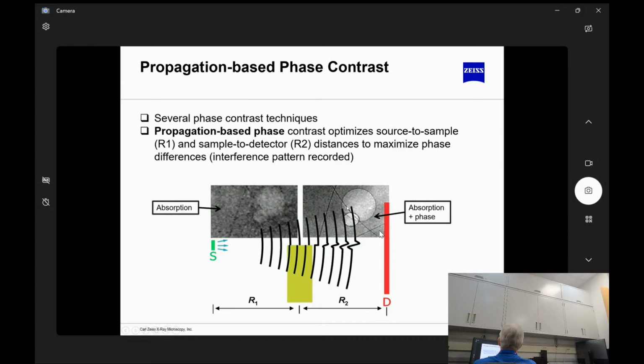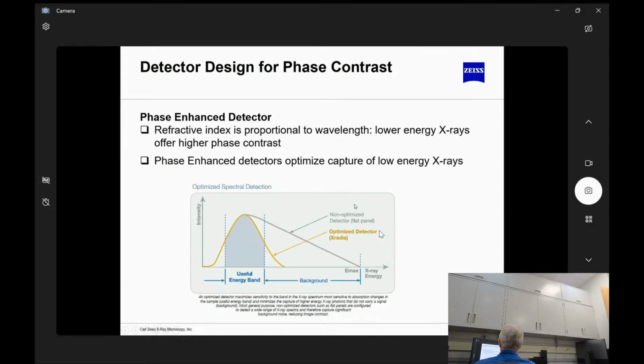But if I've got my system set up with very low cone angles, so instead of having a cone angle of 25, 30 degrees, I have a 1.2 degree cone angle, now I'm going to get a phase contrast signal across those edges. So I'll have a black line and a white line, which again sometimes makes it hard to do some automatic segmentation on that. But as a first step, actually seeing stuff, it makes life wonderful.